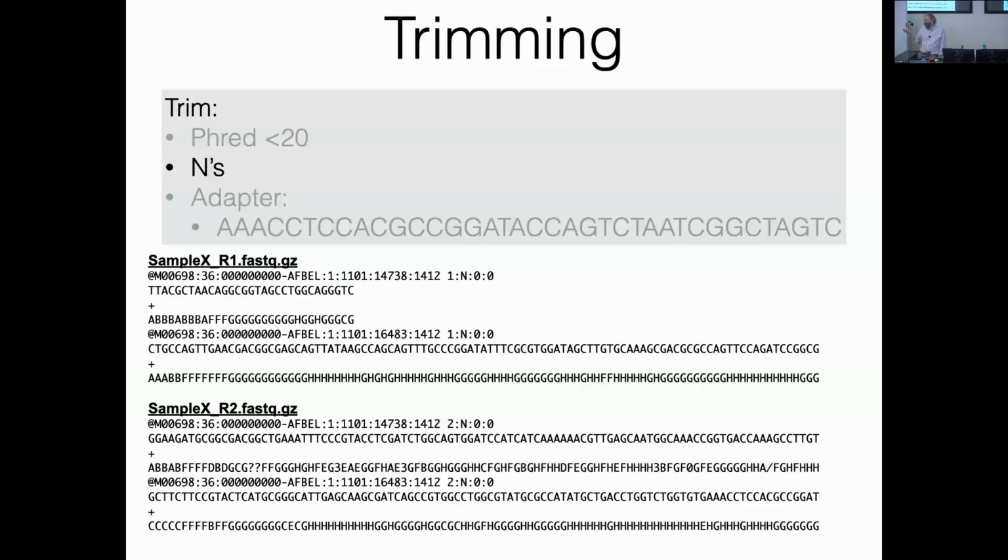I'm actually not sure if the reagents are being refrigerated while they're on the machine or not. The DNA is sitting there and getting imaged, and the laser might be damaging the DNA. There are all sorts of things that can go bad towards the end. Again, it's hand-wavy, and I haven't seen a good explanation for what exactly is happening.